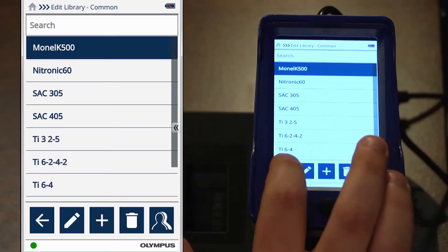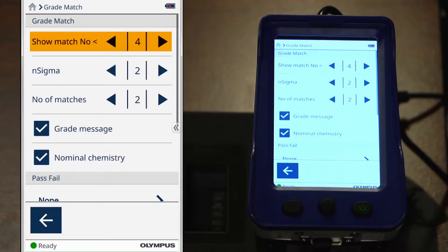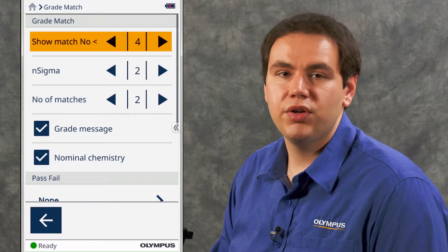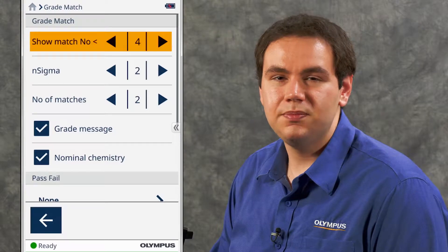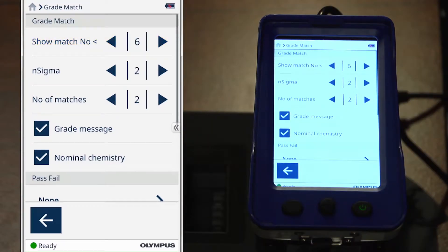Let's go back to the grade match page. You'll notice across the top that it says show match number less than 4. The match number is an indication of how closely the chemistry of your sample matches the chemistry specified in the grade library. A value of 1 indicates a very good match, whereas a value of 10 indicates a poor match.